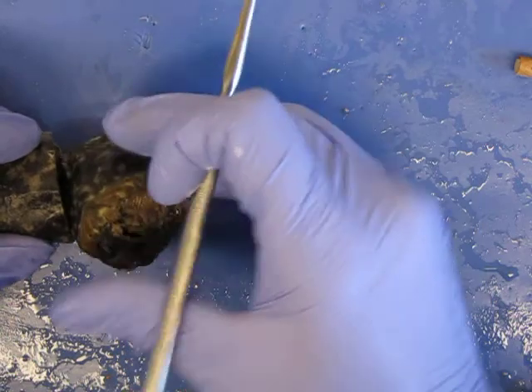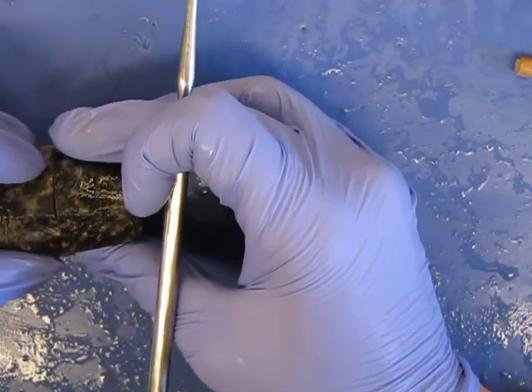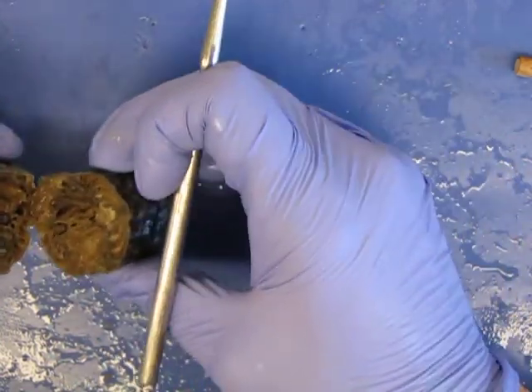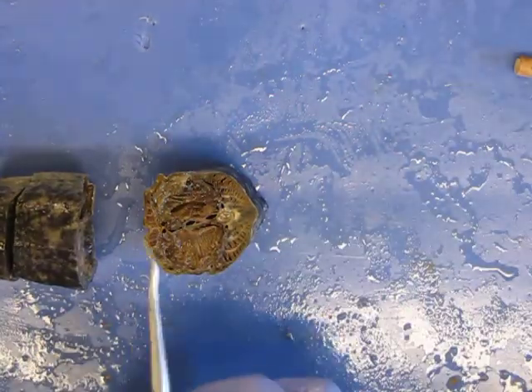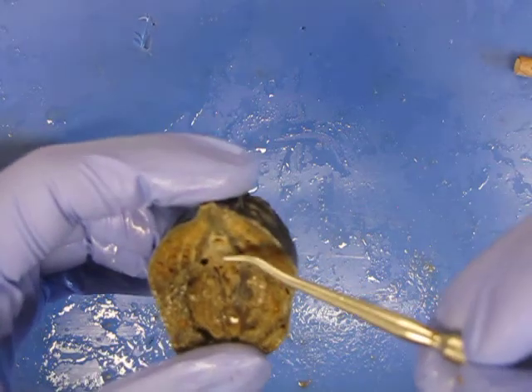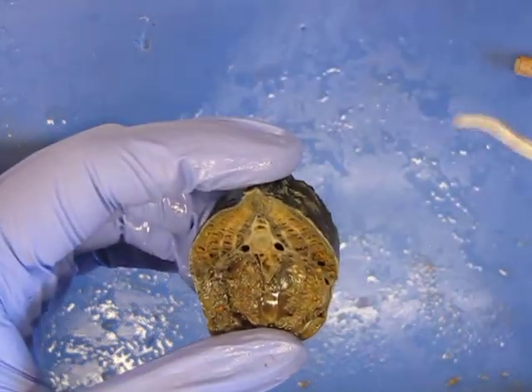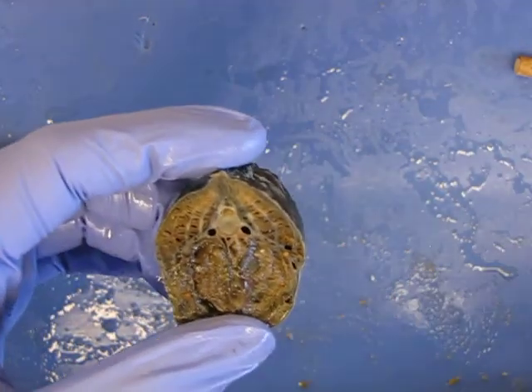Part of lining these up like a puzzle is also making sure all the color fits just right. The organs look like they go together just right. Anyway, keep working your way down. Notochord, spinal cord. And we haven't started too much of the hemopoietic tissue just yet.